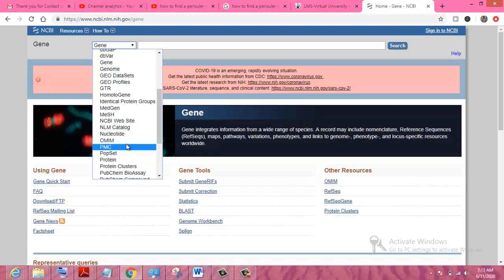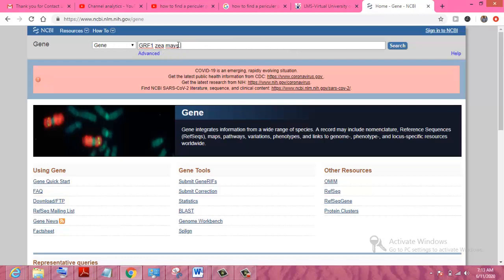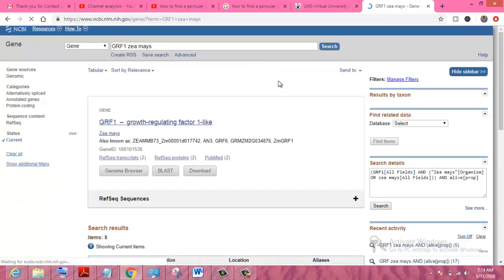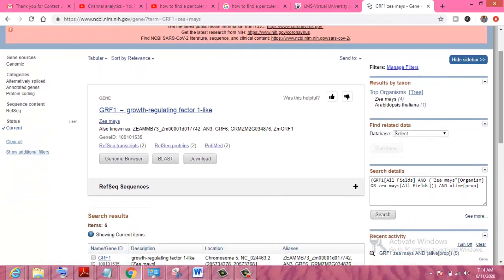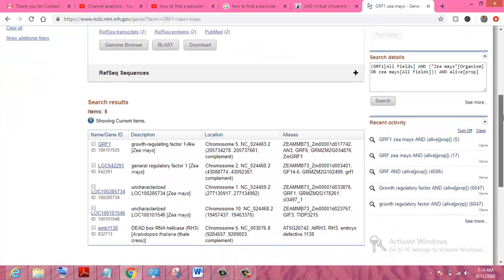Our topic is to search a particular protein within a gene, so first we select 'Gene' and then write the name of the gene. For example, I want to find the gene GRF1 in Zea mays. Zea mays is a corn seed — it's a plant — and GRF1 is a gene. We search GRF1 here, and you can see some results showing the plant Zea mays and the gene GRF1 growth regulatory factor.